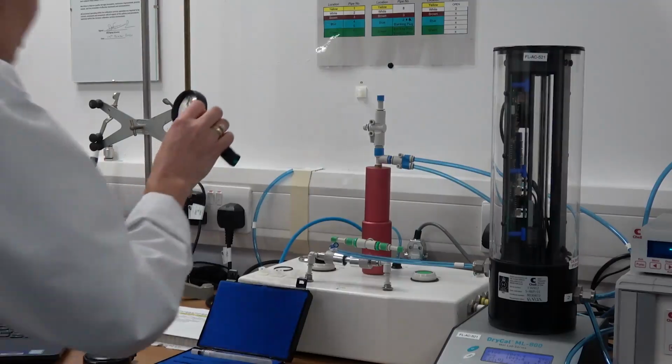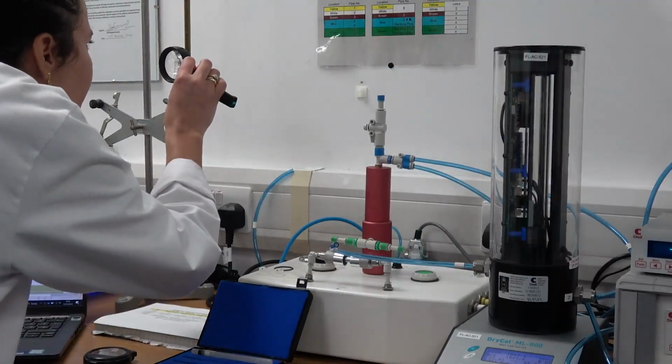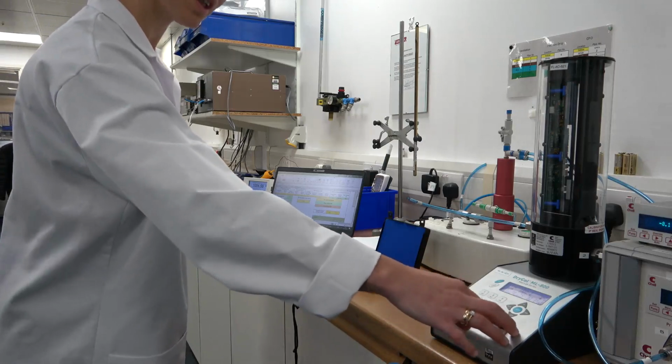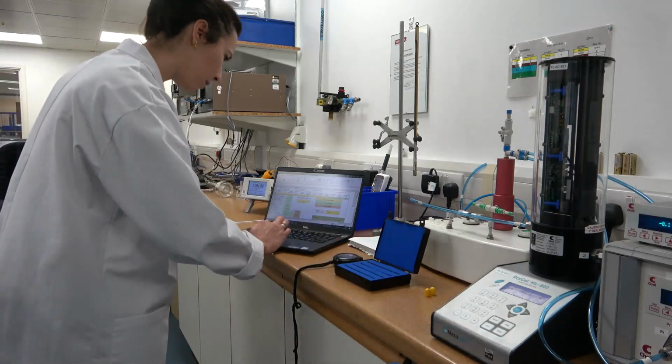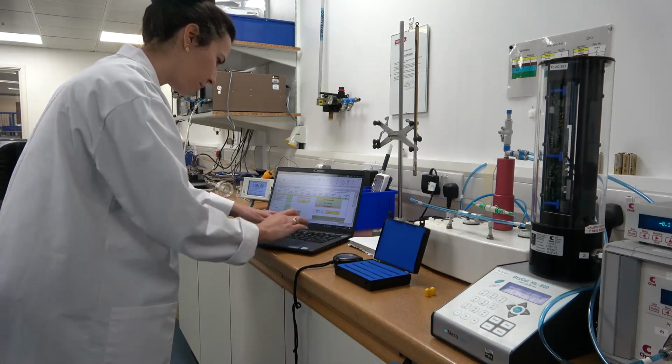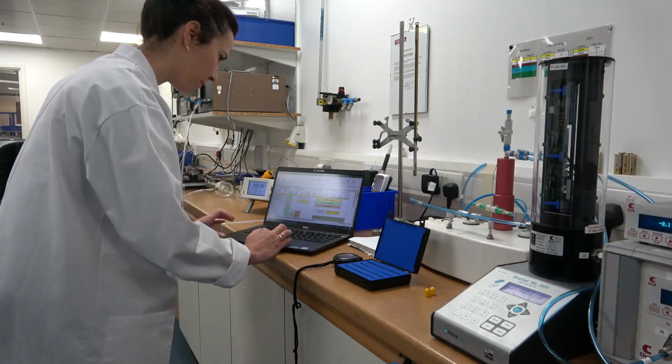The calibration process complies with ISO 6565-2015. It incorporates compensation for the effect of ambient conditions on the measured PD to present the result that would have been obtained under industry standard conditions of 22 Celsius degrees, 1013.25 hectopascals and 60% relative humidity. The conditions are standardized since they affect the density and viscosity of air and hence the flow rate through standards.